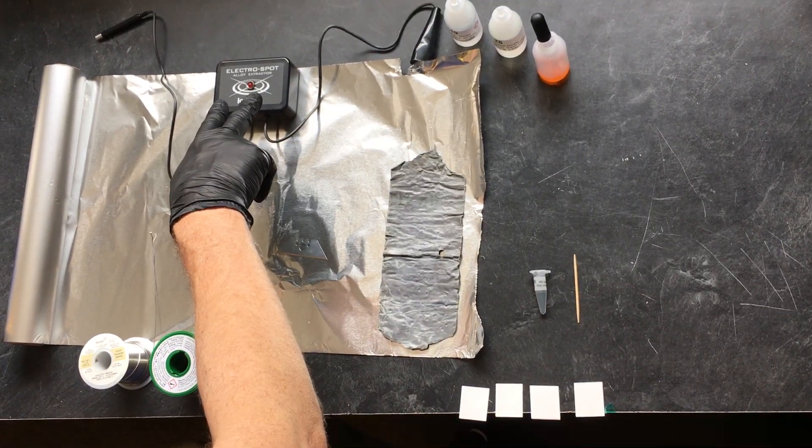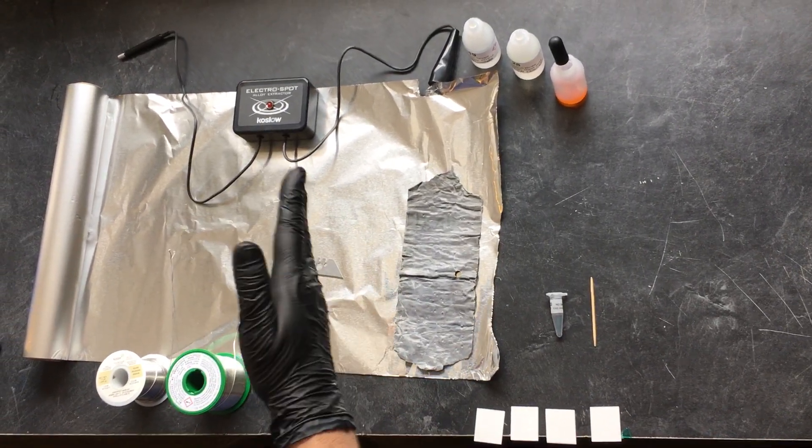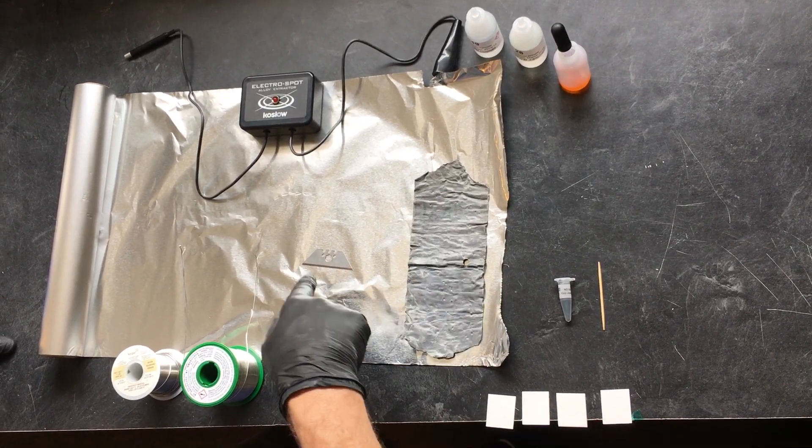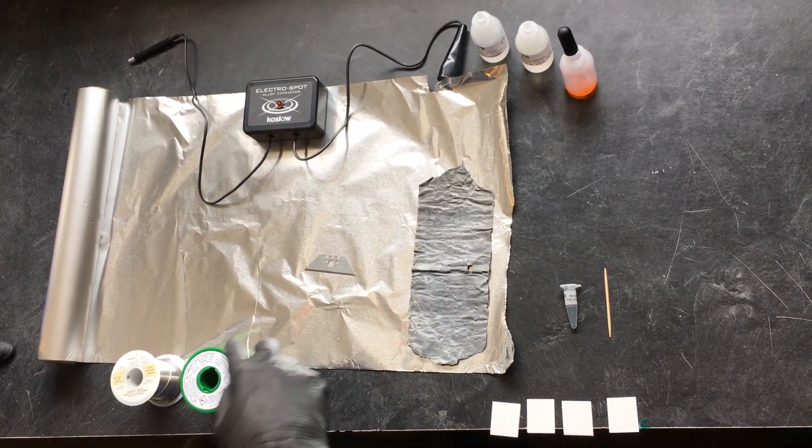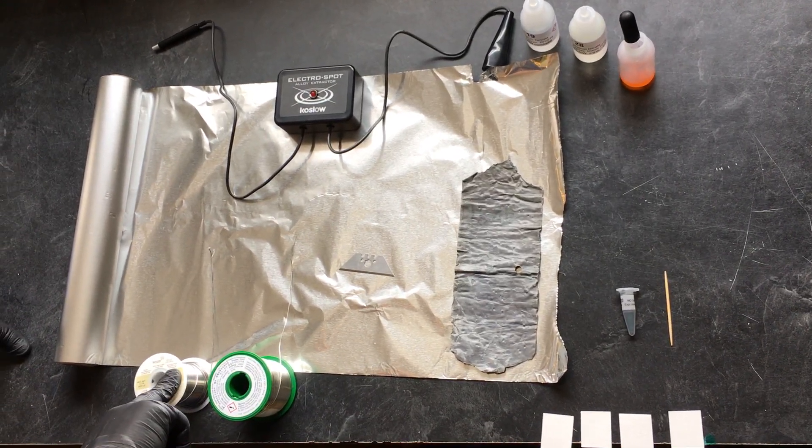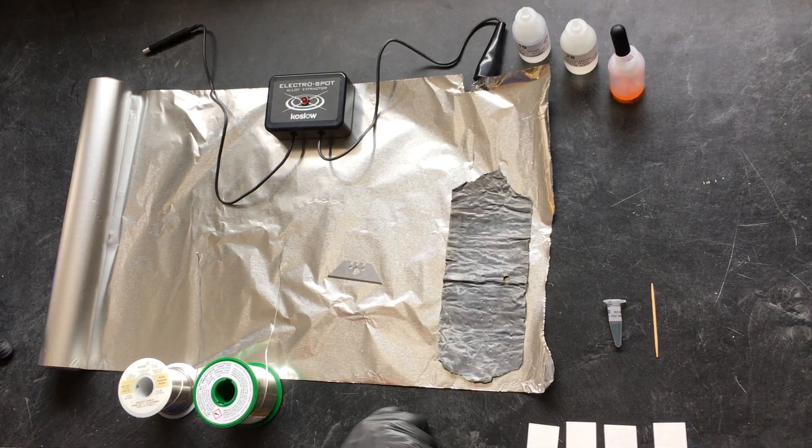I'm using the Kozlo ElectroSpot and I have four objects here: a sheet of lead, an ordinary razor blade, this green roll is lead-free solder, and this is regular solder. And let's try the results.